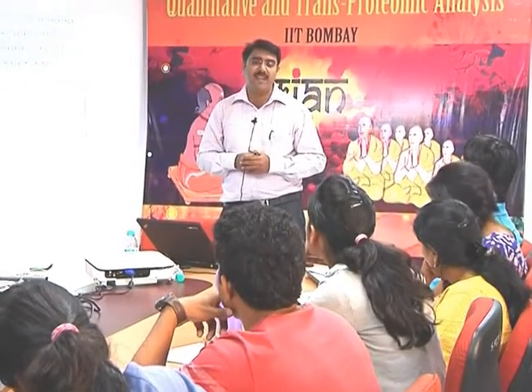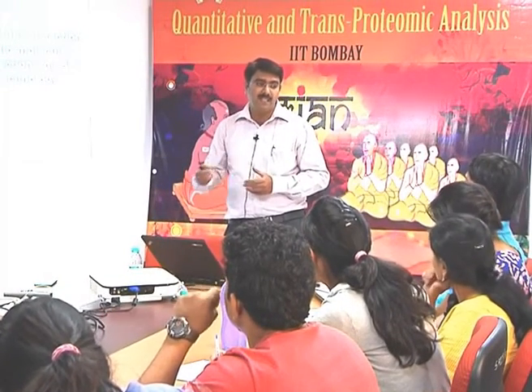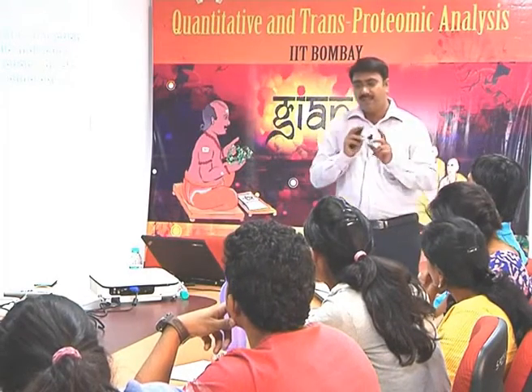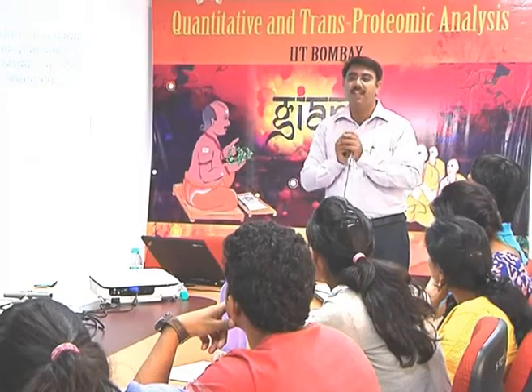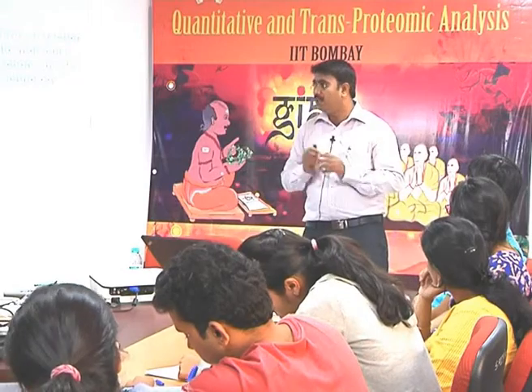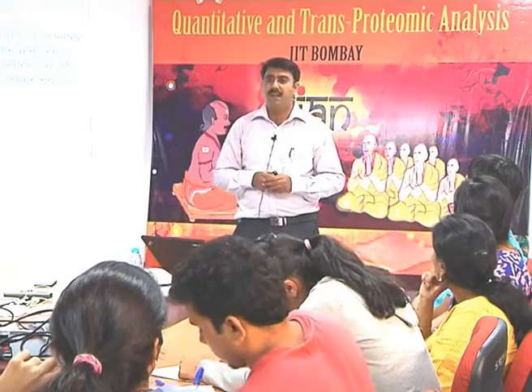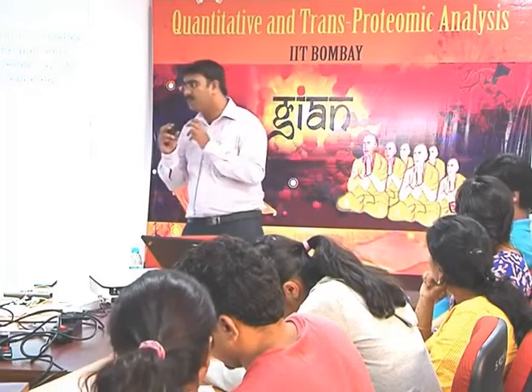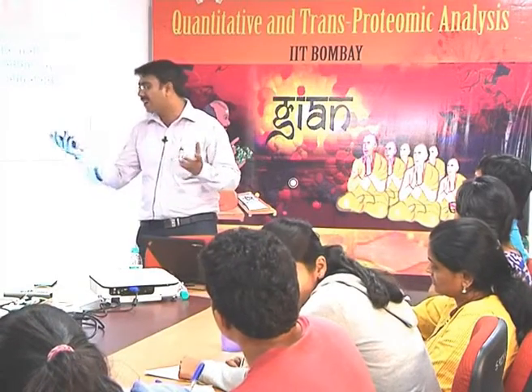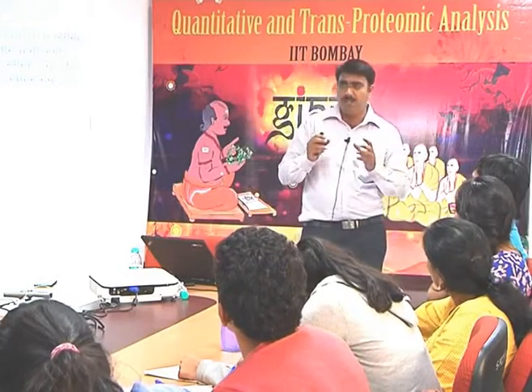Even in the case of iTRAQ or ICAT-based mass spectrometry, you are attaching a tag right there. Label-free detection is a different concept: solution interface and solution-solid interface. These are the two techniques. You have heard about ITC, isothermal titration calorimetry. Where two proteins are interacting together, what energy is absorbed or released into the reaction system? We call this a solution interface.